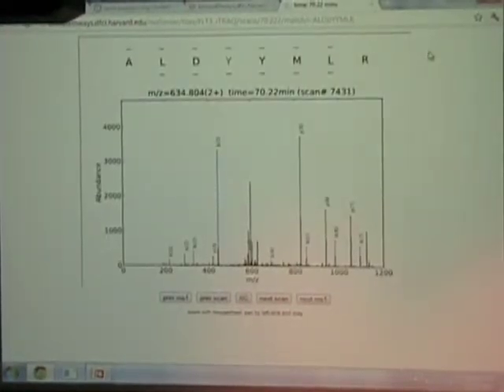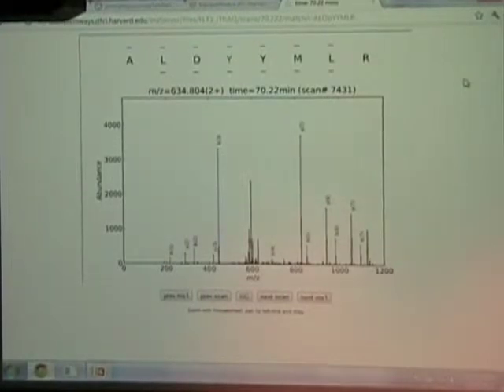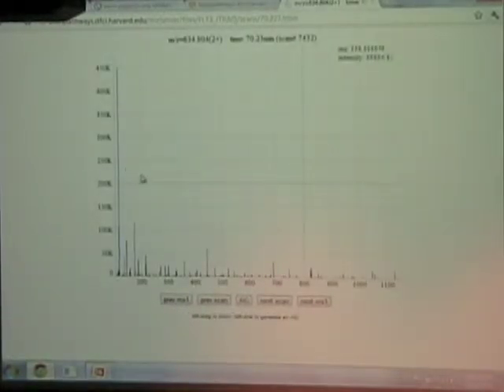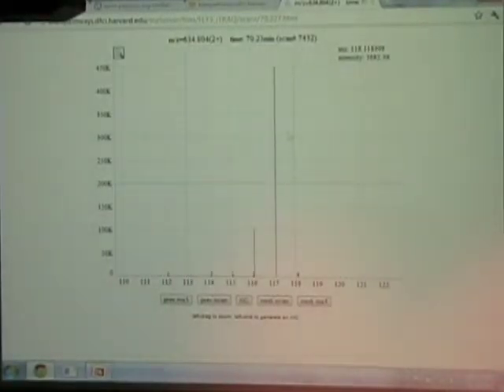So one very important aspect of the data that is currently not usually supported... Actually, let me go to that later. Recall earlier I said we were doing one scan for the ID and another one for the quantitation in iTRAQ. And so if you go to the next scan, this scan is acquired, you see that there's not a lot of signal where the peaks are that you use for ID, but all of the signal is here in the iTRAQ region. And as I promised earlier, the 117 peak is much greater than the 116 peak.